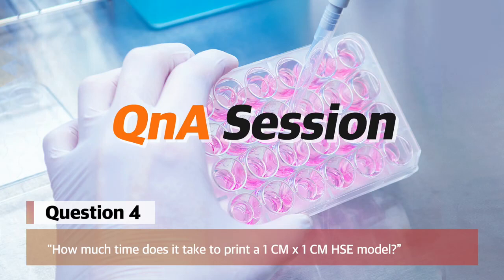And additionally, I'm now trying one clinical trial for diabetic foot ulcers, and I print a kind of artificial dermal patch. But basically, it is not really an artificial one because we actually use autologous cells. So I print 10 centimeter by 10 centimeter as a maximum for one print with the doctor in vivo. And of course, the depth is not that deep. It's only 5 millimeters, and it takes only like 10 to 15 minutes maximum.